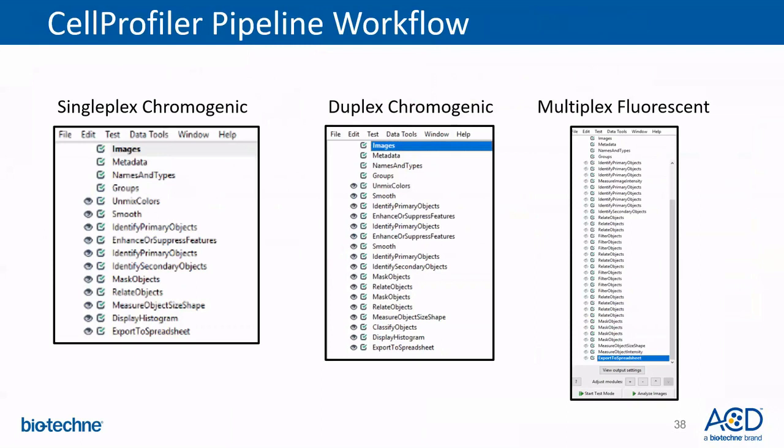Here we see our recommended workflows within CellProfiler that we suggest can be used as a starting point, which you may think of as a backbone or a blueprint for image analysis. The CellProfiler software refers to these as pipelines. The pipeline provides the organizational structure for each analysis and allows a huge amount of flexibility and user-friendliness for all sorts of image analysis applications.